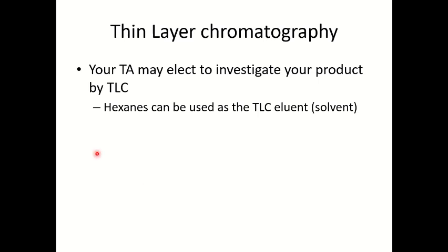product. Then you use hexanes in the chamber as the mobile phase, as the liquid used for the TLC, and at the end you compare the spots that you got from the starting material and the product. If you got the same relative height in both the starting material and product, it means that you have the same product. The starting material, it means that it didn't move. Yeah, I remember that you use the starting material as a reference to compare.